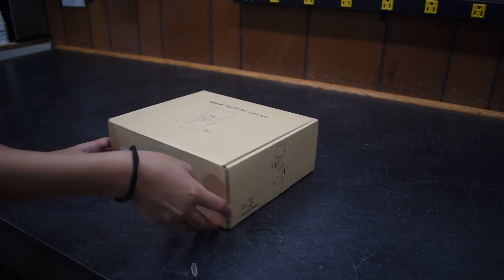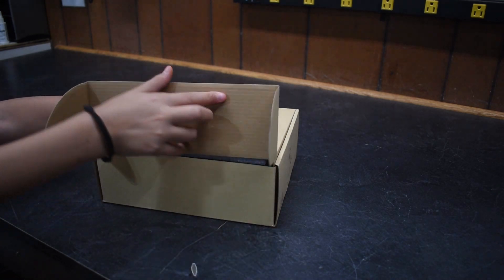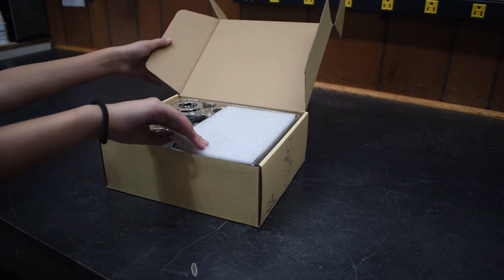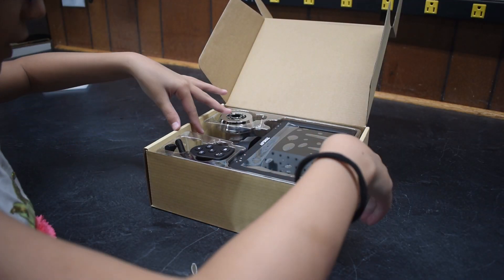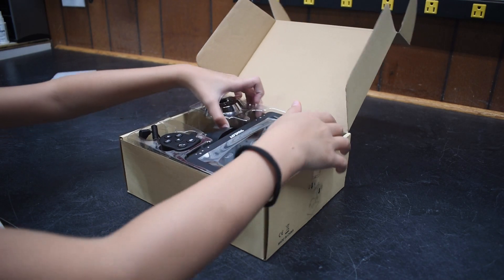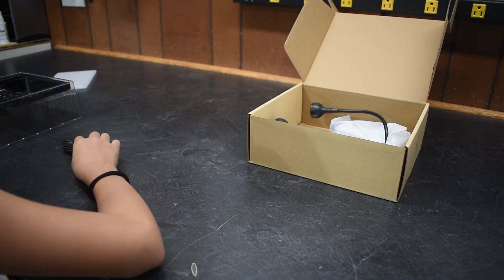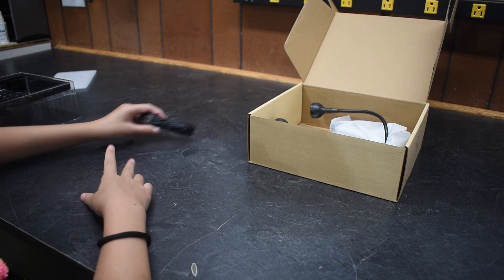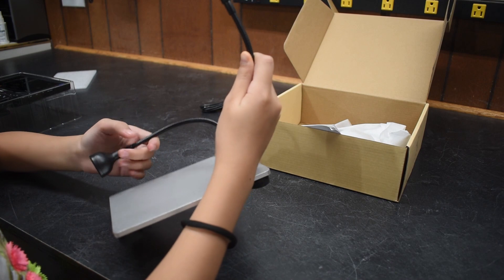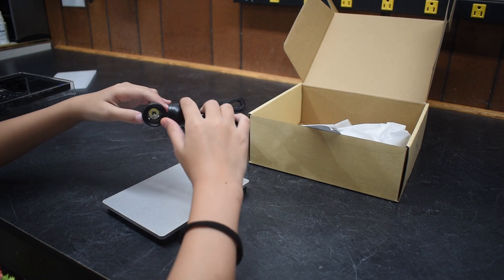I want to be careful, but also I can't. Now we carefully pull this out. We have the charger or whatever. What's that? A table for it. Looks like the base and some lights maybe.